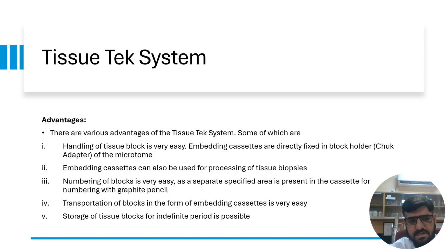Numbering of blocks is very easy, as a separate specified area is present in the cassette for numbering with graphite pencil. Transportation of blocks in the form of embedding cassettes is very easy, and storage of tissue blocks for an indefinite period of time is possible.